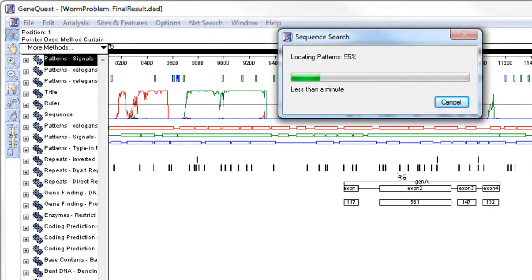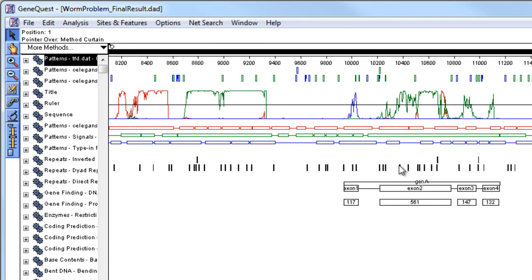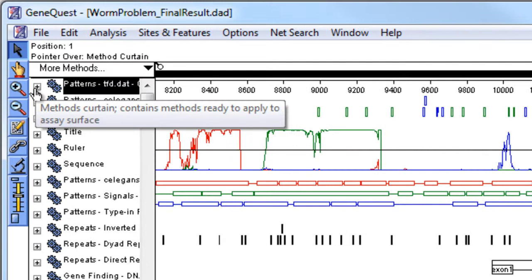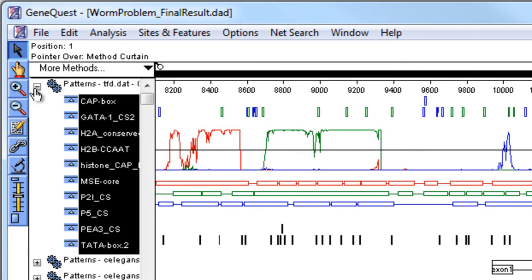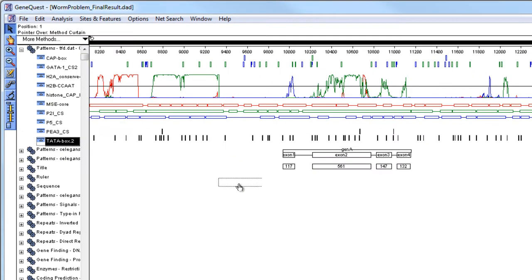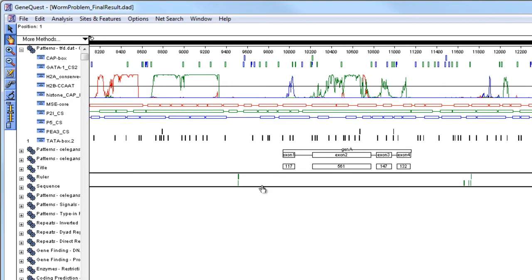Then click OK, and GeneQuest will locate all the patterns that meet the criteria we selected. Now I'm going to click the plus icon to reveal all the patterns that were located. I can apply any of these patterns to my sequence simply by selecting one and dragging it onto the assay. Here we can see the places along the sequence where the TADA Box 2 pattern is found.